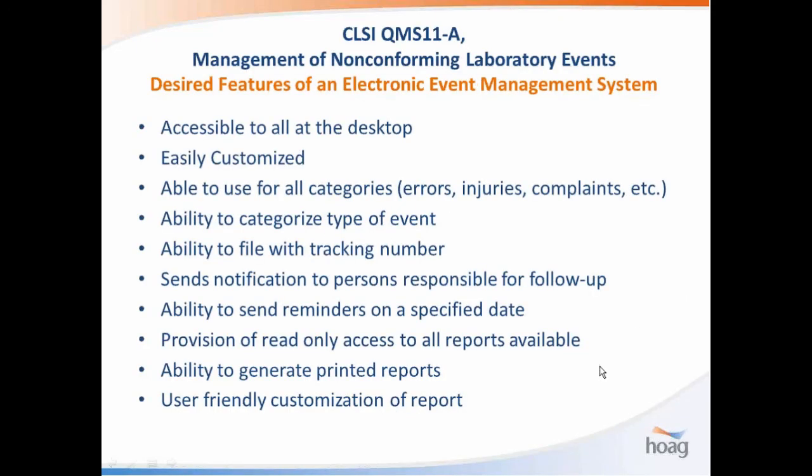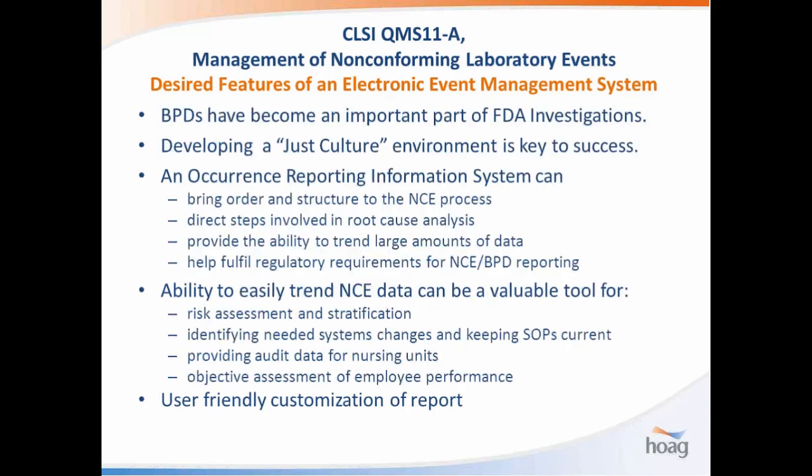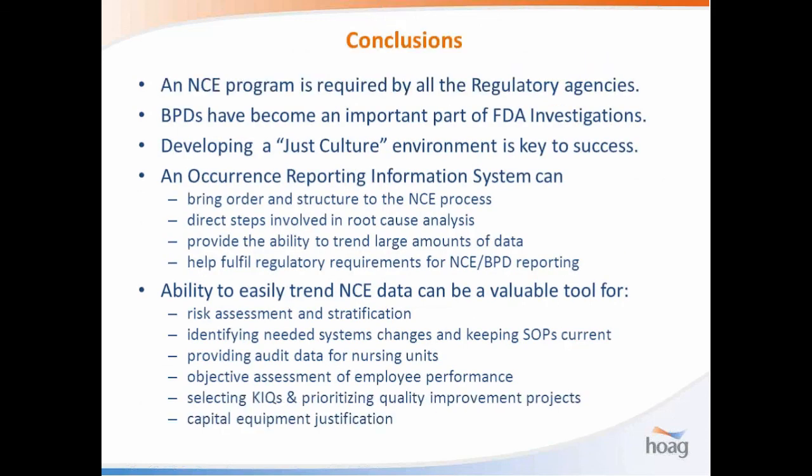CLSI has a document on the desired features of an electronic event management system, and I really think OTIS satisfies all of these. And again, I'm not trying to sell you the product, I'm just an enthusiastic user of it. So in conclusion, the NCE program is certainly required by all the regulatory agencies. BPDs have increasingly become an important part of FDA investigations. So if you're an FDA regulated site, make sure you're doing a thorough job on your BPD reports.